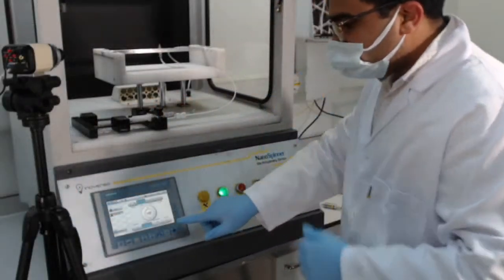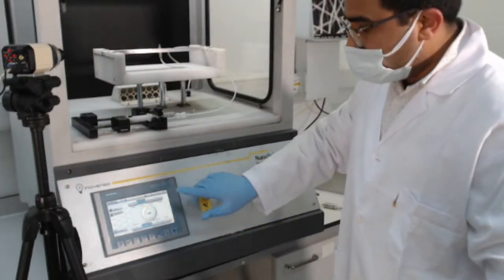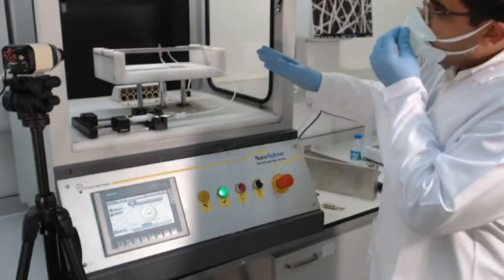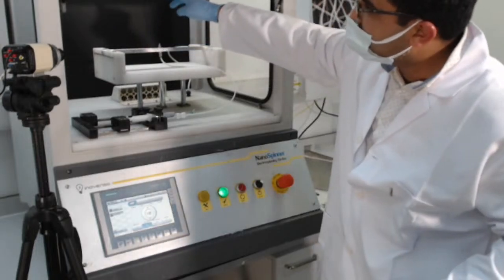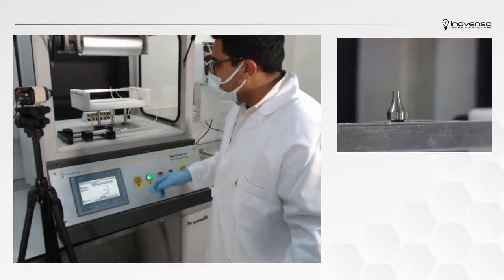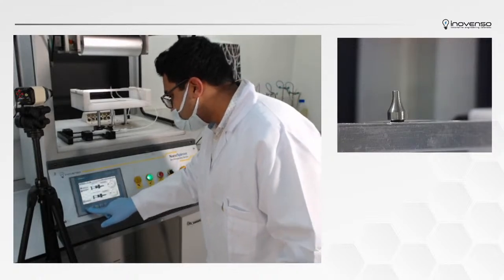Since I'm using a nozzle, I have to press the nozzle mode. Also, since I'm using a drum, I have to press the drum mode so that it sets the spinning distance accordingly, so that the distance from the tip of the nozzle to the face of the substrate is accurate. It's going to be 15 centimeters. We're using PVDF here.